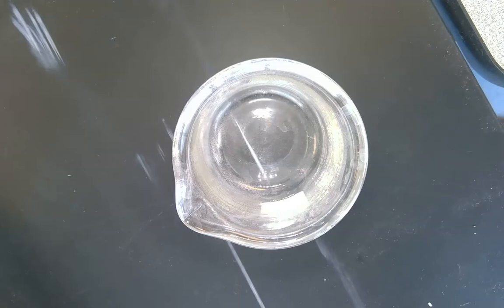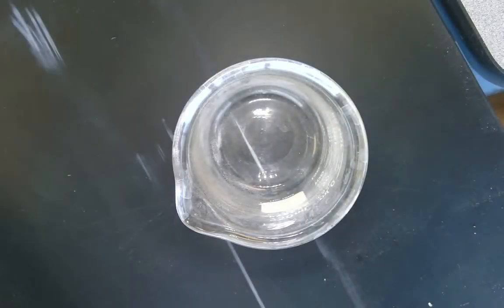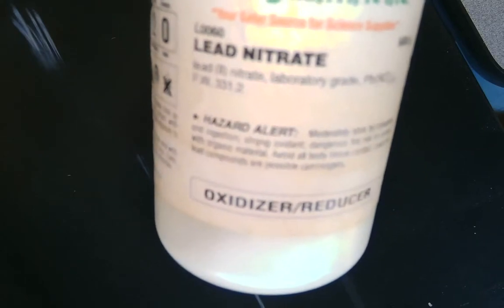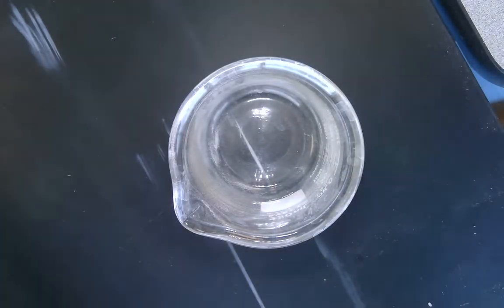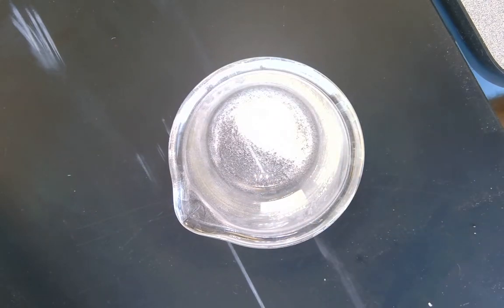So it's a nice little example, I think, of just the idea that they have to collide. I've got two chemicals here, potassium iodide, KI, and lead nitrate, Pb(NO3)2. These guys will react in a double displacement reaction to make lead iodide and potassium nitrate. And so I'll put a little bit of solid potassium iodide in there.